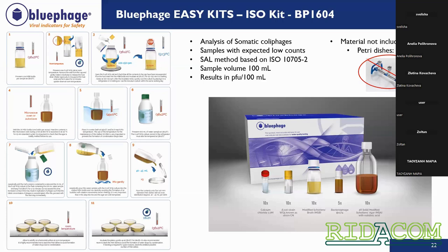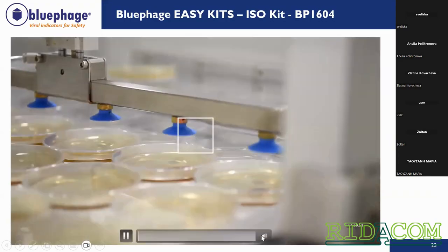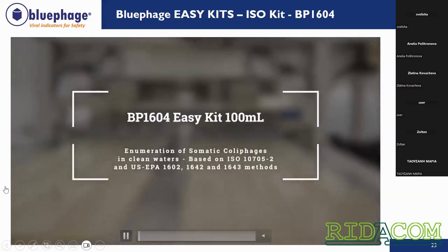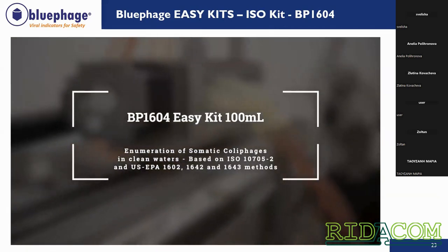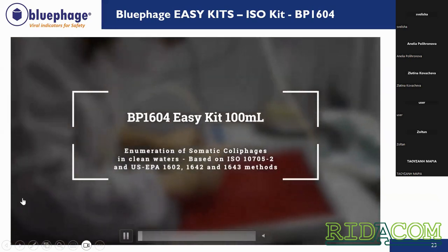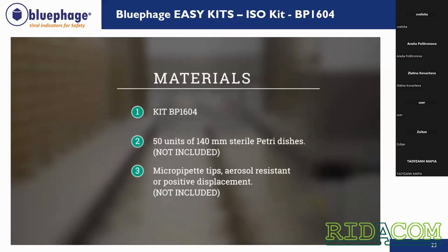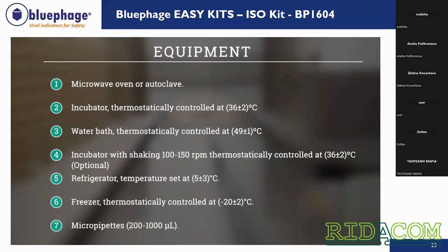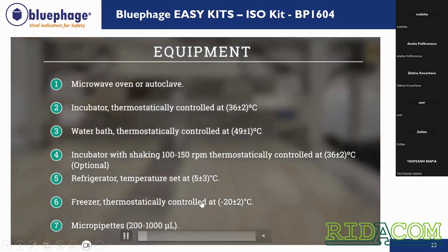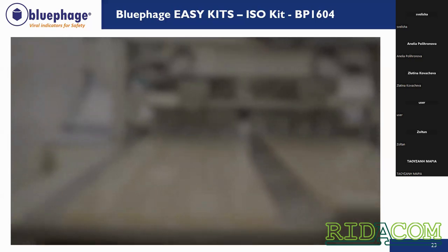One of the main advantages is that we don't need to do a filtration, because we are analyzing the 100 milliliter volume sample directly. The materials that we need are the kit and the empty petri dishes, because this methodology is based on the ISO, so it only uses one layer of MSA, a single agar layer methodology. And obviously the micropipette, just for the positive control. Here we need the microwave or autoclave, the incubator, the water bath, the incubator with shaking, which is the same as before, and the refrigerator and freezer.